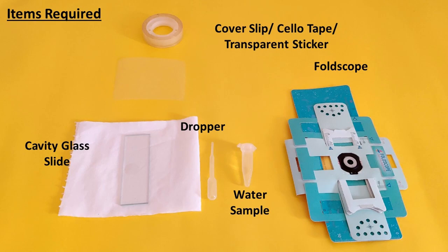For this we will require a foldscope, a dropper, a glass slide with a cavity, a cover slip, cello tape or a transparent sticker wider than the cavity in the glass slide. We will also need a sample of water from any source accessible to you.